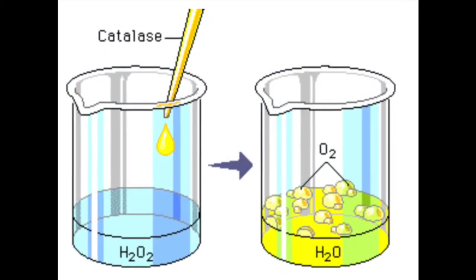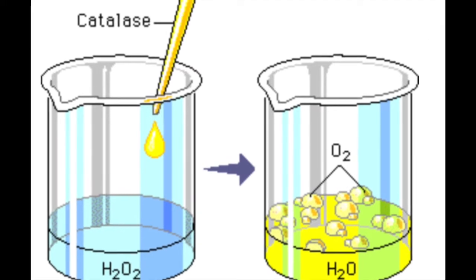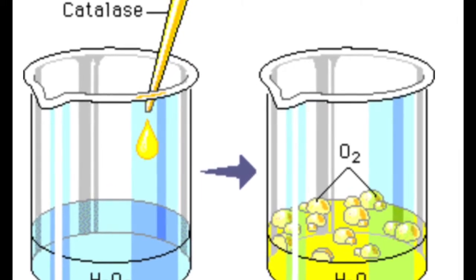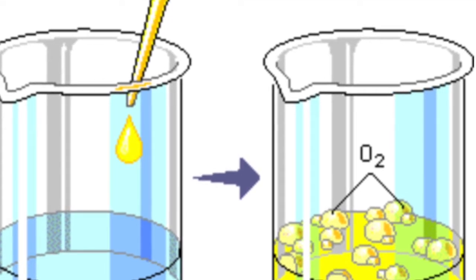Our hypothesis was, if the amount of product synthesized is related to time, then the longer the amount of time the reaction is allowed to occur, the more products will be present, because enzymes are not consumed within the reaction and are reusable, so product will accumulate over time.